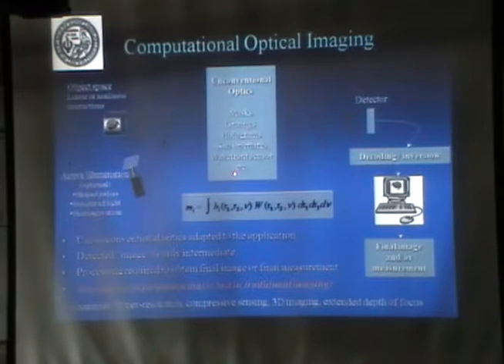What I'm saying here is, let's try to do another transformation and get different information. Images are not always what we want. Of course, this is going to be a detector array, a CCD, so it's going to look like a meaningless image. But the question is, what information can you get there? The main point is that by playing these tricks, you may be able to capture information that is not normally obtained with just the lens.